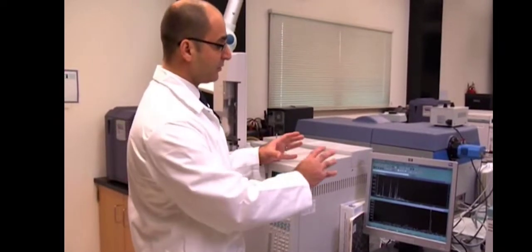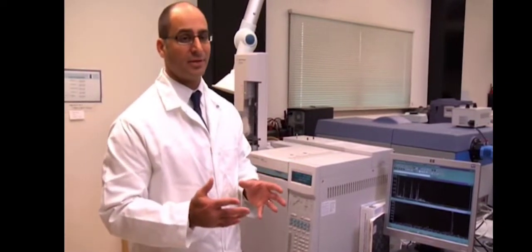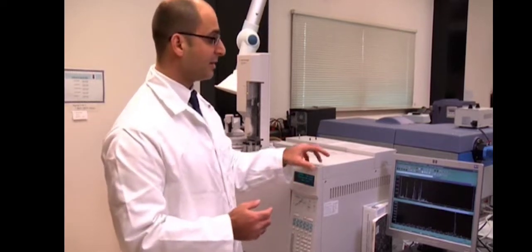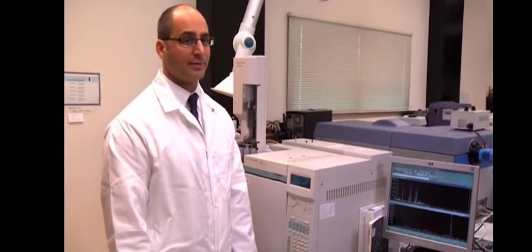We'll also take a look at the overall pattern. And combining that information, we're going to try to figure out if any ignitable liquid residues are present. If we think that there is something present, we're then going to go into our reference library and compare the samples to try to identify what type of ignitable liquid might be present.